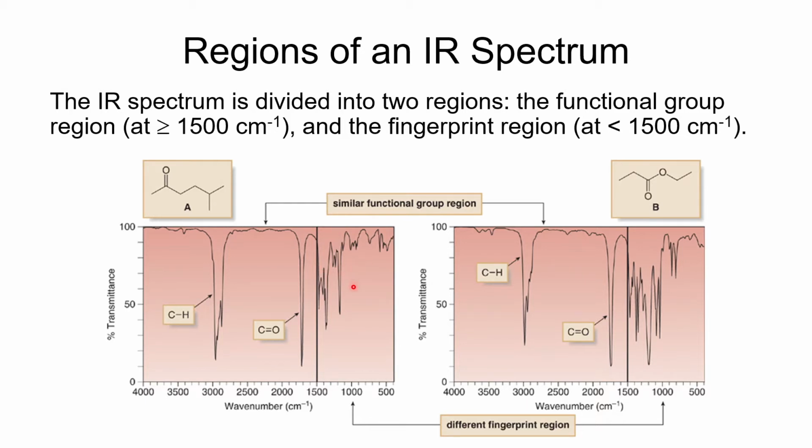It's still different vibrations and stretching and bending motions of the molecule, but there are a lot of very subtle interactions that go on. And so the reason they call it the fingerprint region is often this part is unique for different molecules. Now, if you have two molecules that are almost identical in structure, it's difficult to see a whole lot of difference in there.